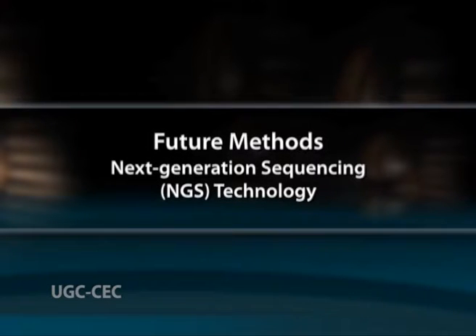Future methods, or next generation sequencing, NGS technology. Next generation or second generation sequencing technologies have largely supplanted first generation technologies. These newer approaches enable many DNA fragments, sometimes on the order of millions of fragments, to be sequenced at one time and are more cost efficient and much faster than first generation technologies.